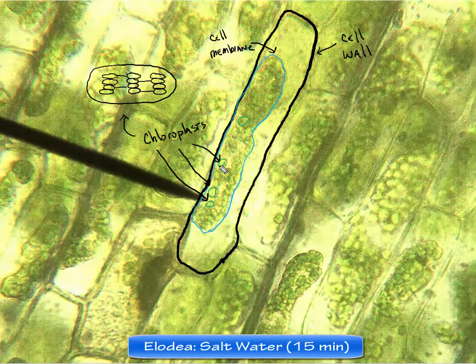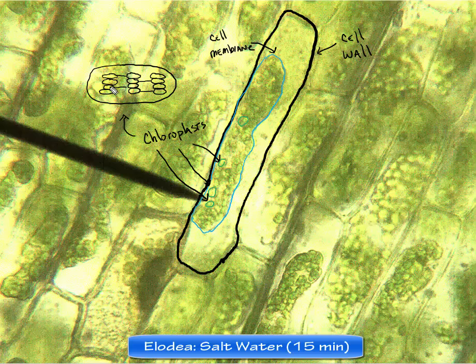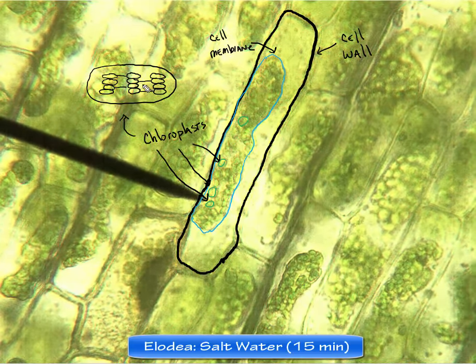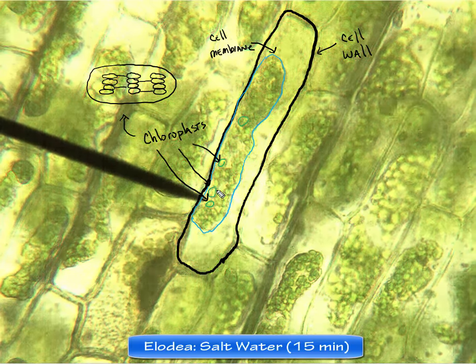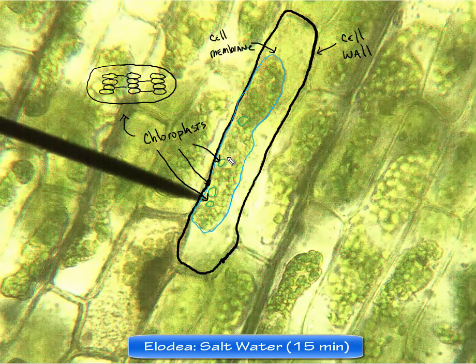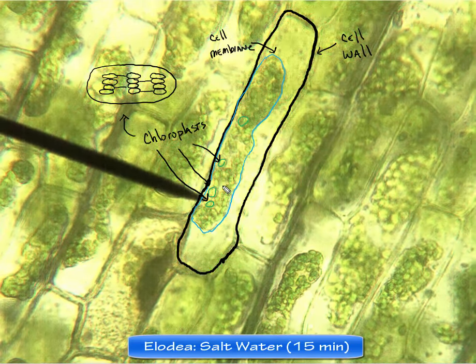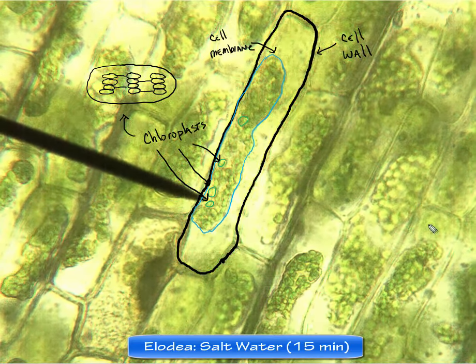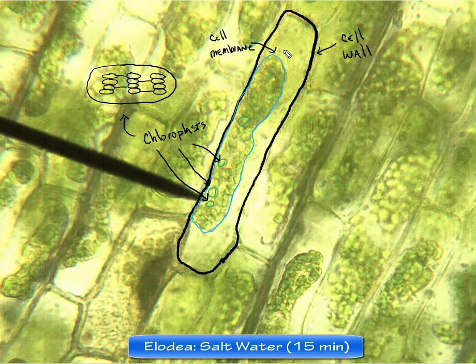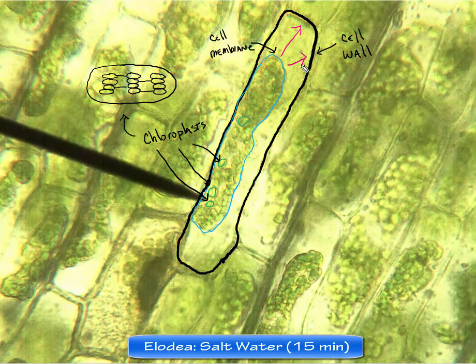And I want to, again, emphasize one more time that the chloroplasts are the guys with the little circles, the stacked pancakes on the inside, called thylakoids, but they're stacked inside, and it looks like a bunch of stacked pancakes. Now, you really can't see that very well here, and it's because we don't have a strong enough microscope. But what we're looking at here is, again, mainly turgor pressure and how much further this has now shrunk from the cell wall. So here we're looking, the cell membrane has shrunk this far from the cell wall.